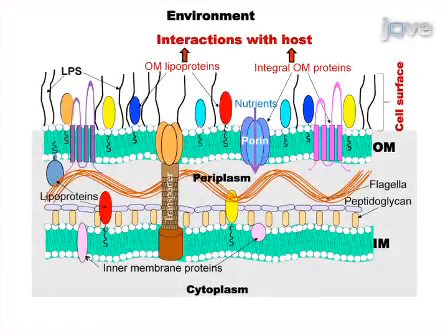Bacterial surface proteins make direct contact with host cells and are also involved in uptake of nutrients from the environment. Therefore, surface localization of bacterial proteins is a key step towards identification of virulence factors. Here, a method to assess surface exposure of proteins on intact leptospires is presented.